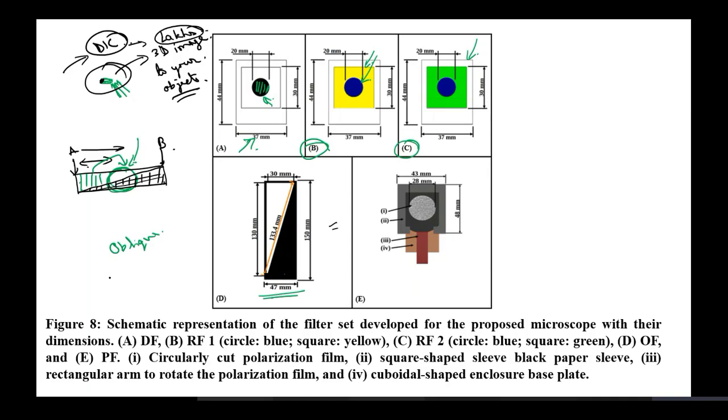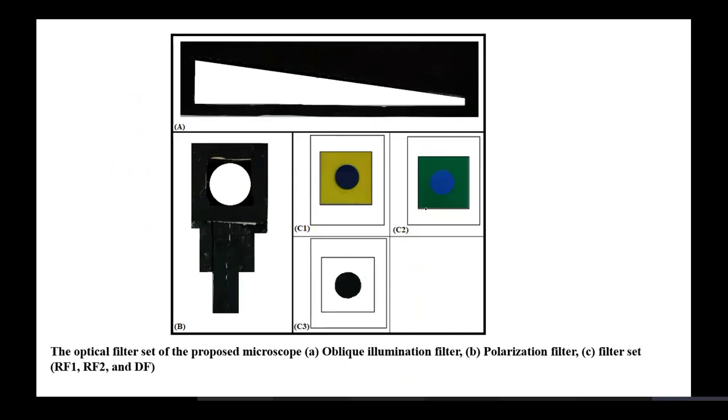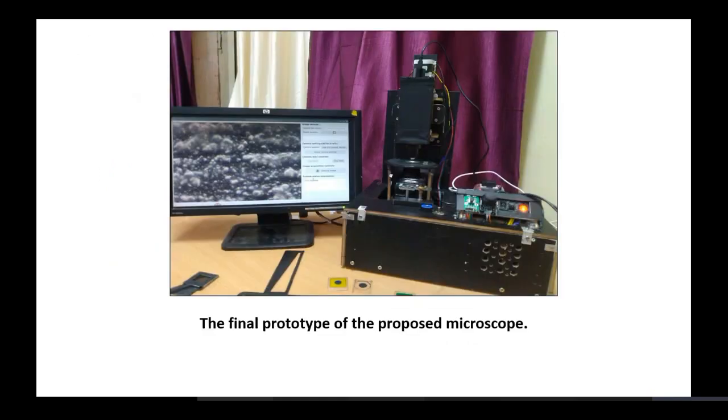It would give you a 3D effect even at a very low cost. So when you come to the lab, we will show you how things work. Then we have this polarizing filter. It can also be used. So these are the filters which have been developed previously.